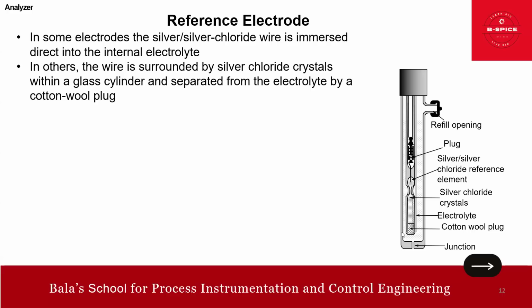This is the electrolyte, separated using the cotton wool plug.